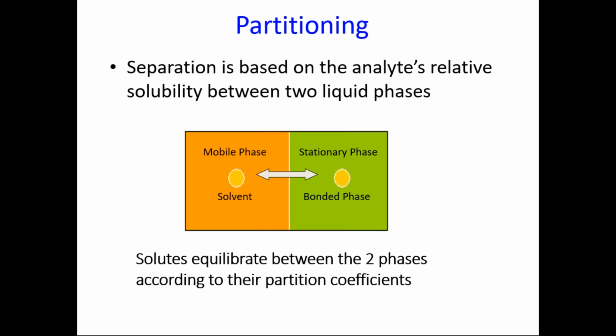So what you see over there is, depending on the solubility of the analyte, the concentration of it will be more either in phase 1 or phase 2. In partitioning also, here in chromatography, it is the partitioning of the analyte between the mobile phase and the stationary phase.